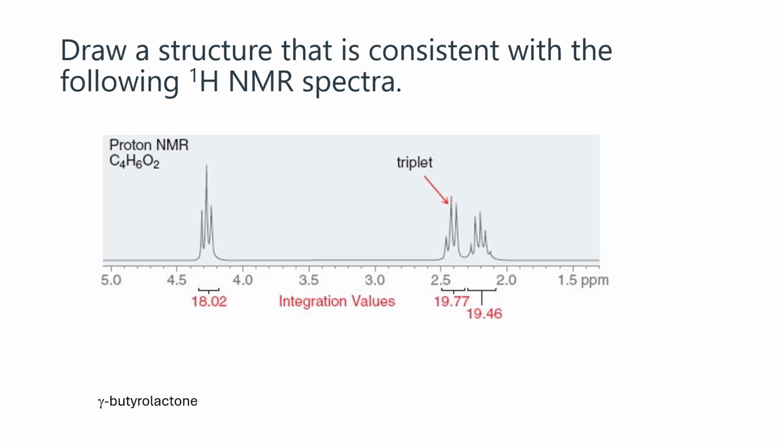Okay. More down. That's more complex. However, what I want you to see is these numbers. So this is like 1 to 1 to 1 or 2 to 2 to 2 in the number of H's, and here I have 6. So that's the amount.